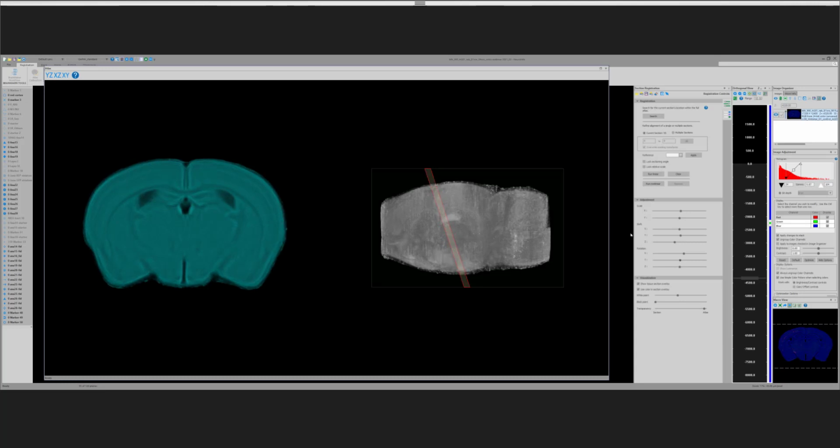And so this red box that Nate pointed out before visualizes the offsets in the x and y axes. What we want to do is find the closest that we can to the Allen space. Now it looks like I've over rotated in the X and probably a little over rotated in the Y. Also I need to shift back a little to make the hippocampus the right size.